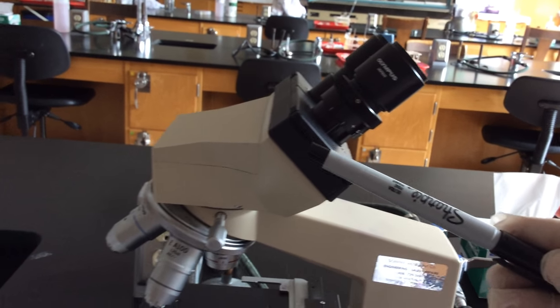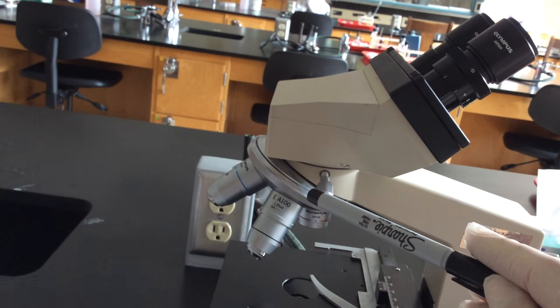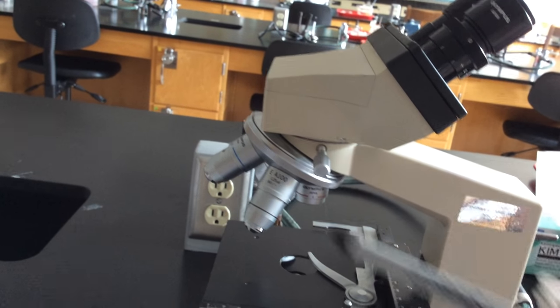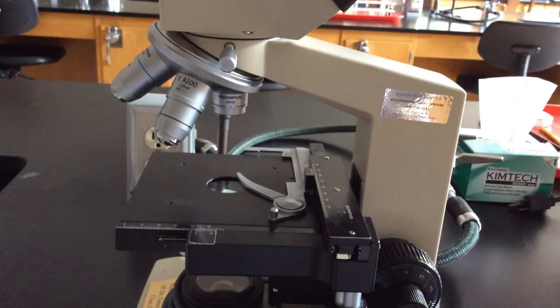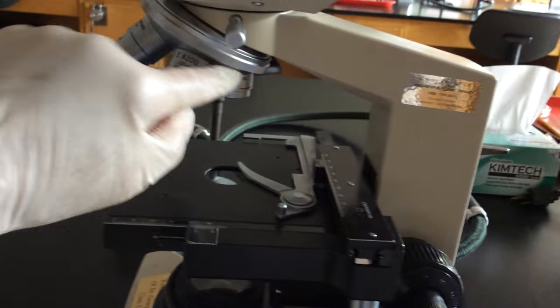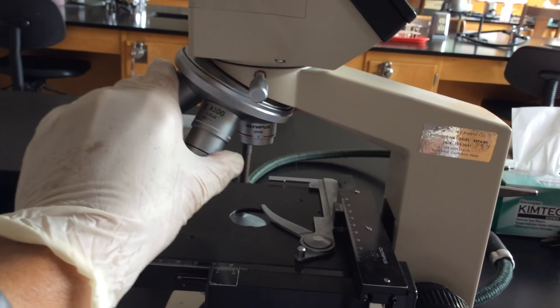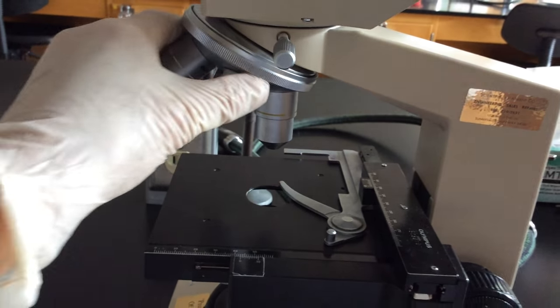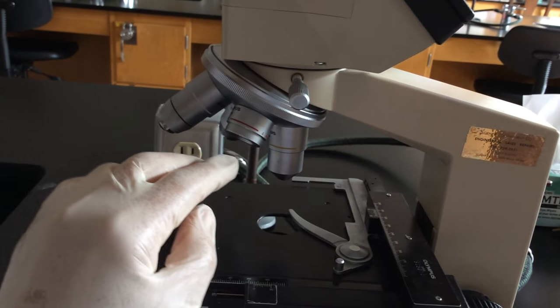All right, we come down here and identify the structure at the tip of the pointer. This is the turret, our rotating nose piece. And here we'll have a chance to look at those objective lenses. We'll start with the least powerful objective lens, and that's the 4x lens. It magnifies fourfold, and you can see it's the shortest lens. So here we have the 4x, the scanning lens. We change objective lenses by rotating the turret, and you'll hear a little click. That click's important because it's telling you that your objective lens is now in alignment with the lens and mirror system here.